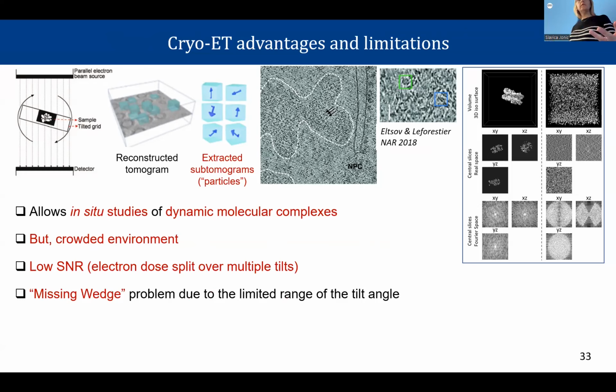If you know the central slice theorem, then you know that if you don't completely cover the orientations in Fourier space, then at the level of combining and then inversion from Fourier to real space, you will get the 3D reconstruction with deformation. So deformations will be visible perpendicular to the tilt axis. This looks okay. This is simulation. But okay, this is what is missing.